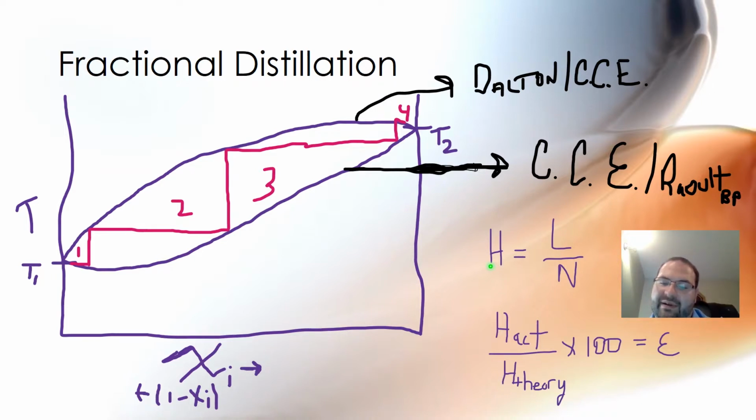So we can't really calculate the actual plate height in this class. We'd have to do some more stuff to get there. And we won't approach that today, but we're just demonstrating that there is such a thing as an efficiency that comes in from having the theoretical number of the theoretical plates and then the actual number that you're able to obtain in the system.